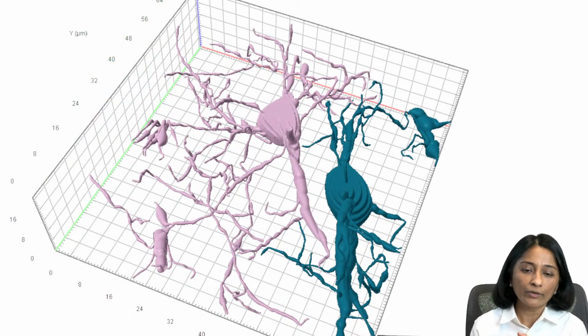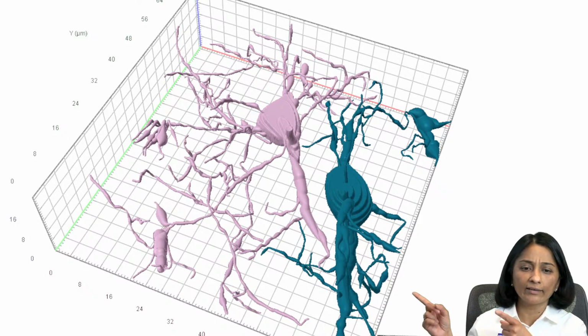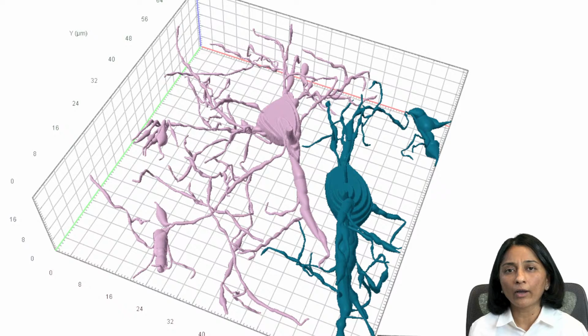Another kudos that I wanted to give is to my colleague in the team, Jason Fung, who was very kind enough to segment the pair of neurons that you're seeing on the screen. There it is. At this point, let's walk over to the Axioscan and get the slide that I want to scan going.